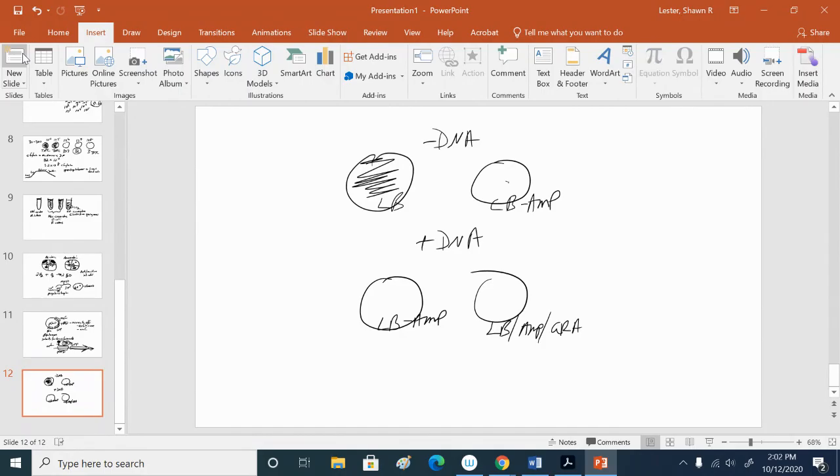So in other words, E. coli are sensitive or susceptible to the ampicillin. And this plate here just tells us our E. coli are alive and they grow on LB agar. And so what do we call these 2 plates in this experiment? The controls. And these 2 plates are the experimentals.